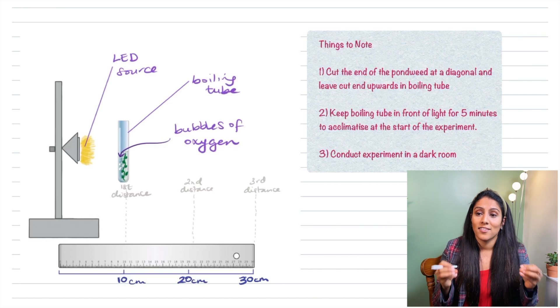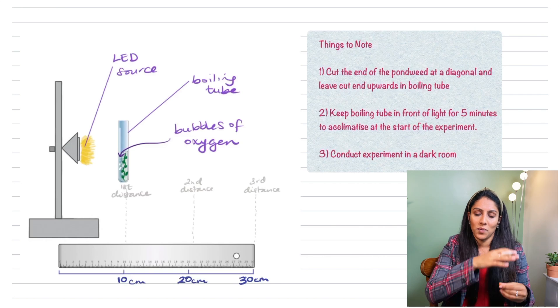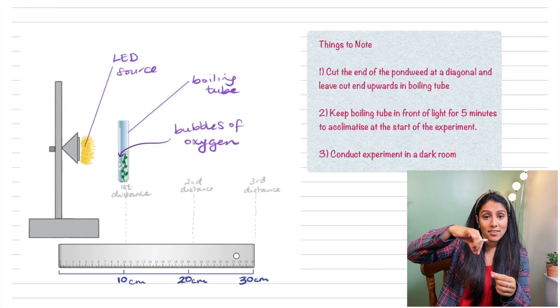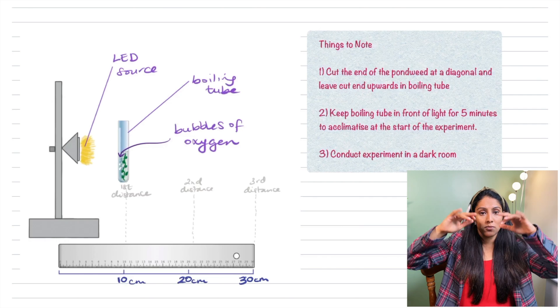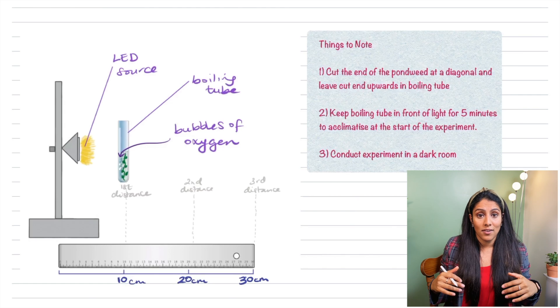So some things to note with this experiment: you must cut the pondweed at a diagonal and leave that diagonally cut pondweed at the top and this allows the oxygen bubbles to be released very easily.